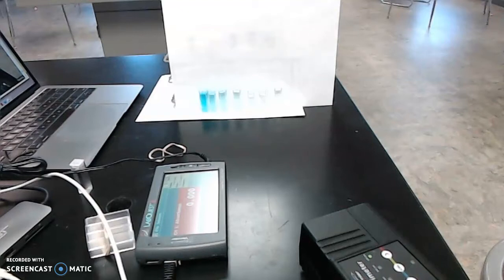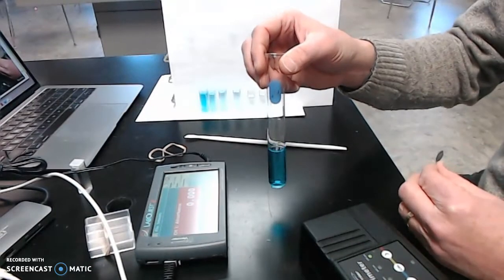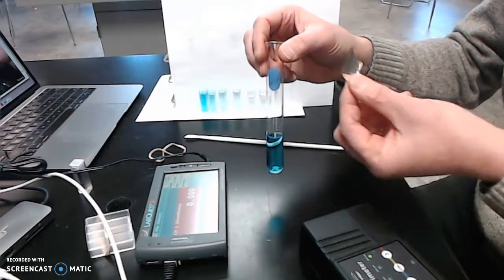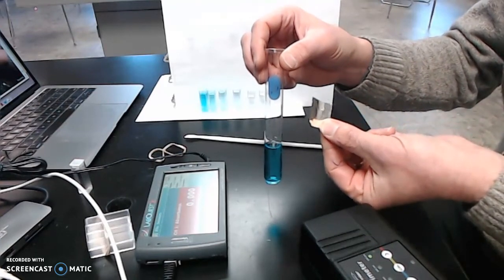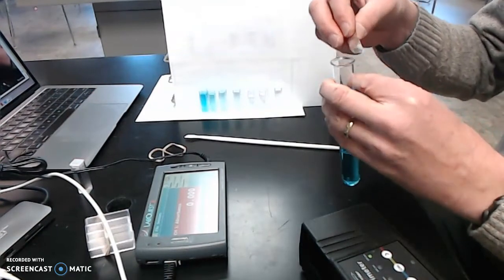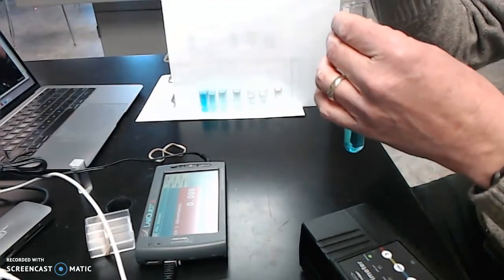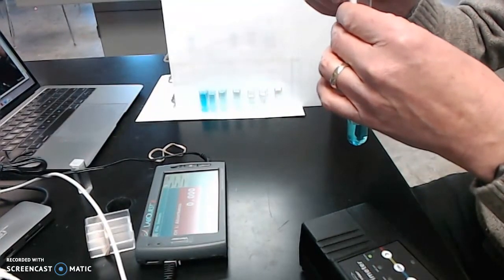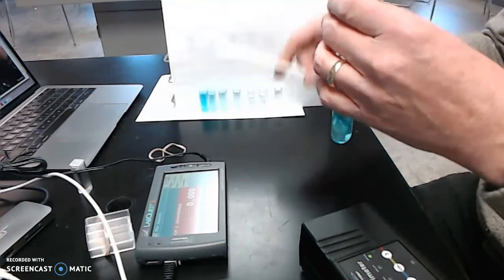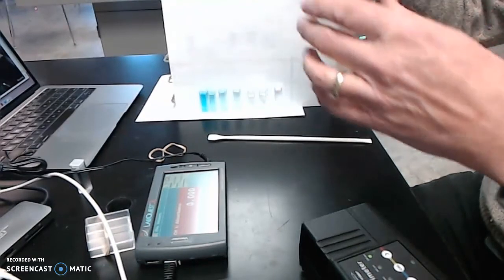All right, so I'm going to start the remediation process. I've got this test tube of the 50,000 part per million copper chloride solution. And here is our aluminum that is 0.052 grams. I'm just simply going to slide this in here. And the reaction is starting right away. It's just a simple replacement reaction. And we'll have a look at this a little bit later.